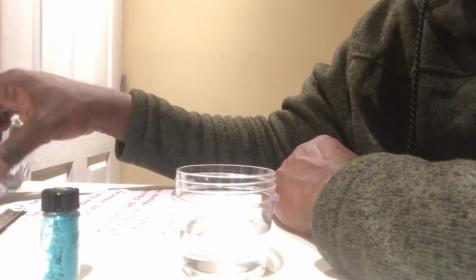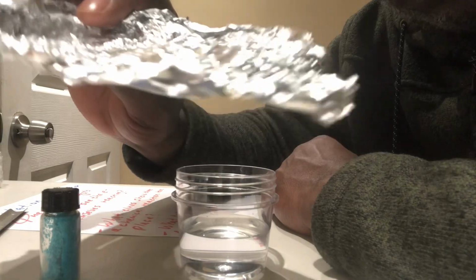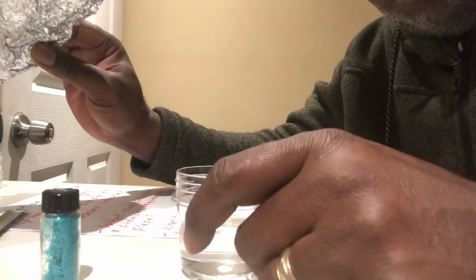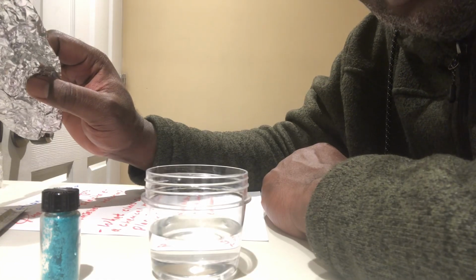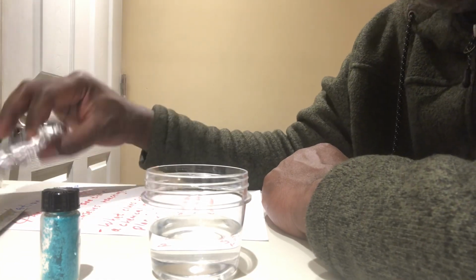Alrighty. Now, what we're going to do, people, is take a bit of this aluminum foil and drop it into the aqueous solution of copper chloride, and we're going to see what happens. So let's see if we can do that right now. I'm going to take some of this chloride and put it in here.